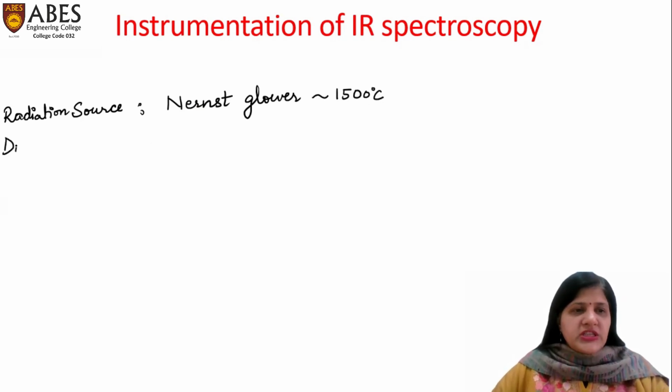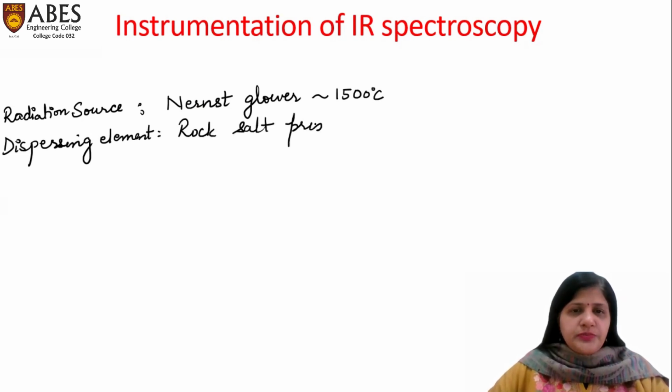We have a dispersing element, which is a rock salt prism. And we have a detector, which is a thermocouple.